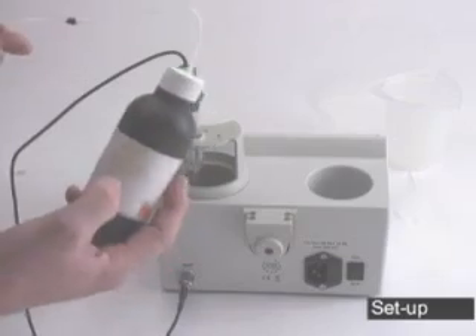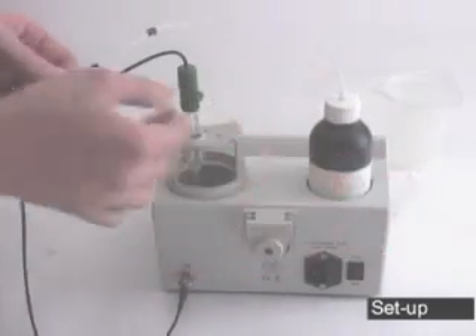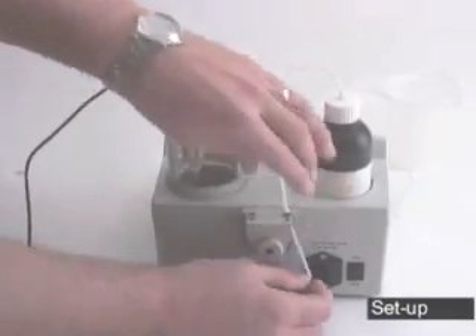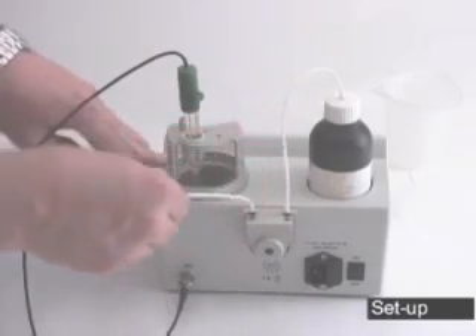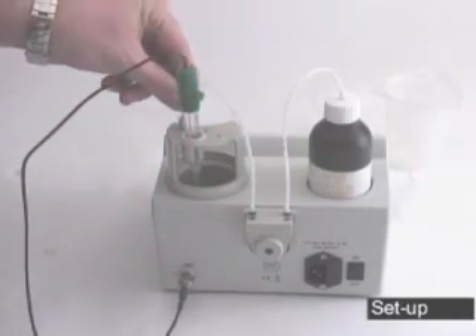Take your tubing and connect it to your bottle of 84100-50, which is going to be your titrant solution. Holding the black rings, place the first one in. Holding the other ring, stretch it around the pump and put it into place. The tip of your tubing will go down the tube next to the probe.